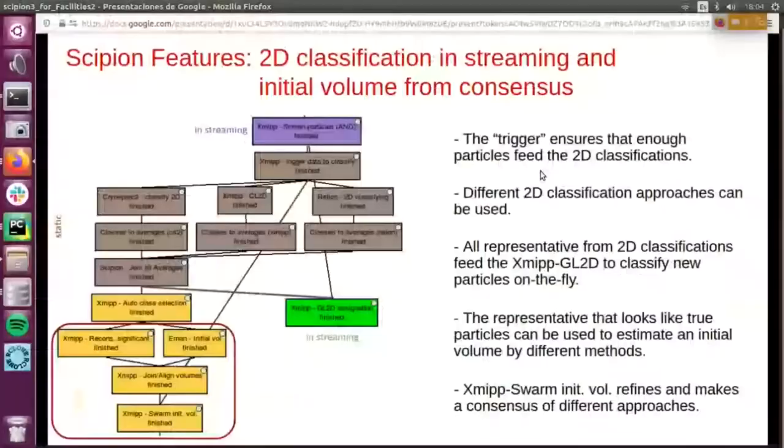And how exactly can Scipion communicate with serial EM? At the moment, there is no feedback communication, I think. That was one project of Javier Vargas, trying to tell serial EM what to do, but at the moment it is not fully developed. So it is only one-directional communication. We can read the XML file and get the information from there, but we cannot talk back to serial EM or EPU.